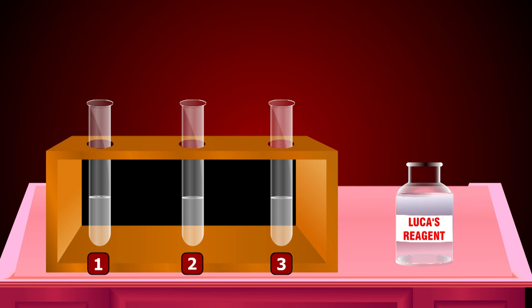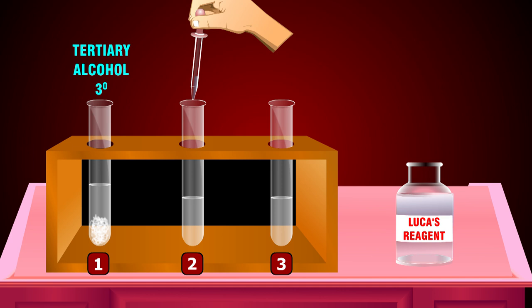In test tube number 1, turbidity formed immediately which shows that it is a tertiary alcohol.